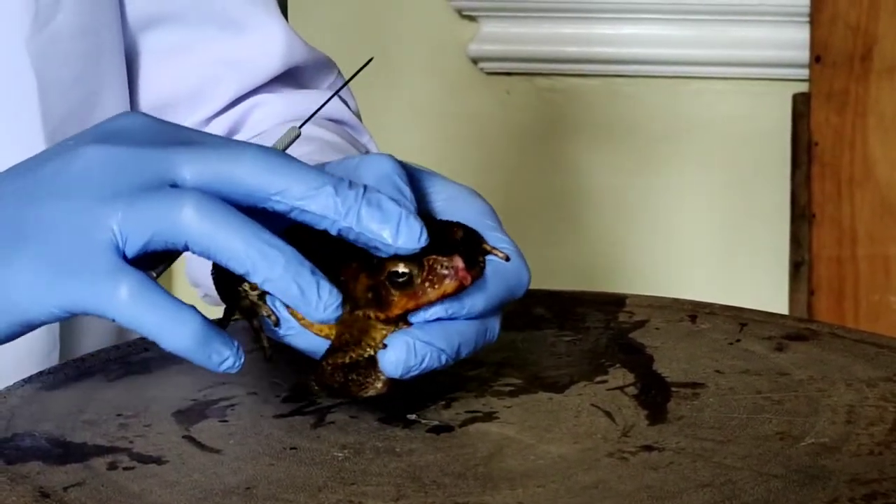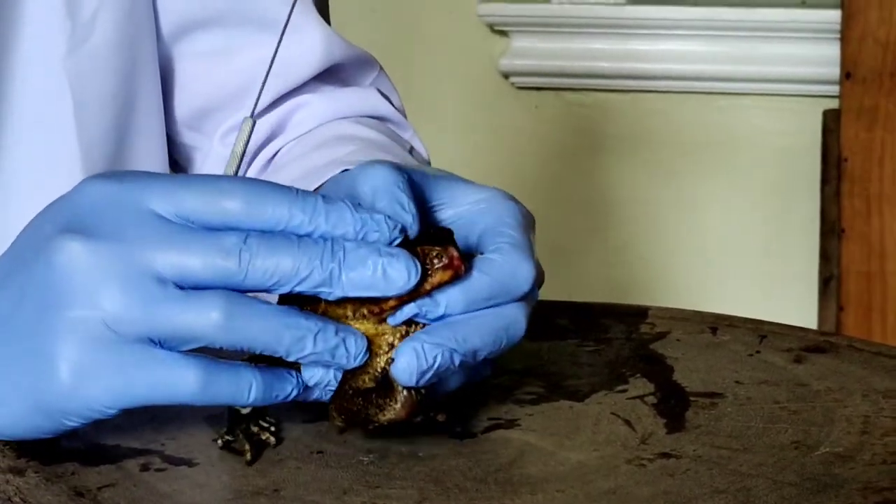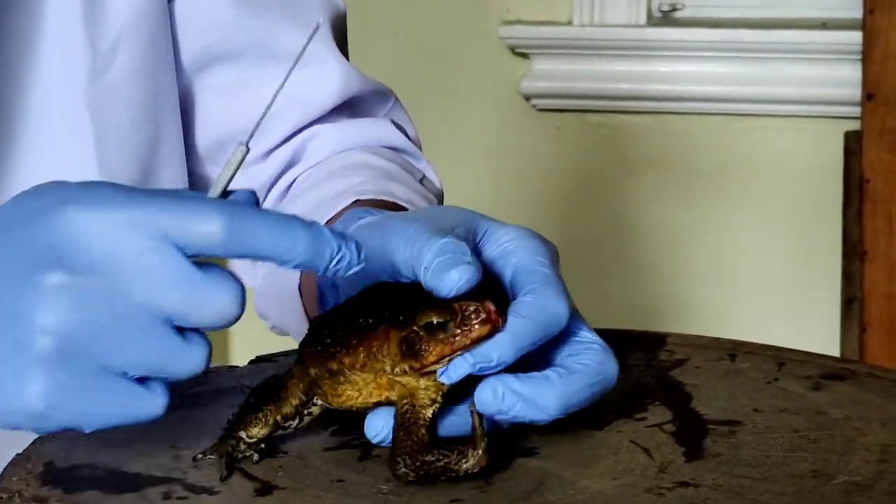Our first goal for this experiment was to paralyze the frog. First, we tried to locate the soft part of the skull and use the probe tool to puncture the area.